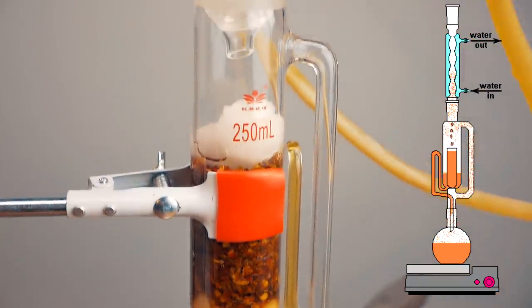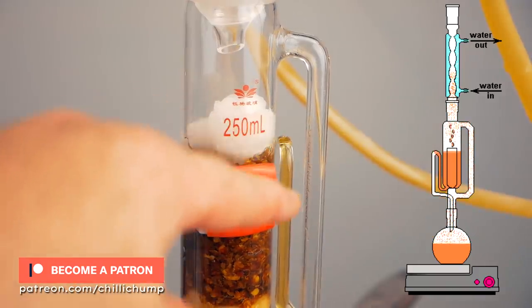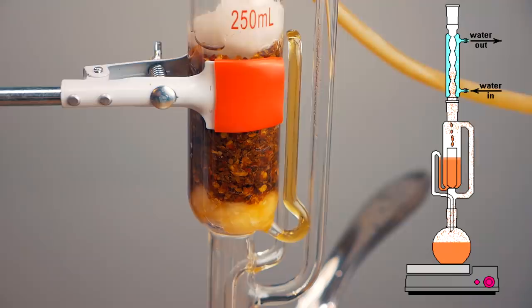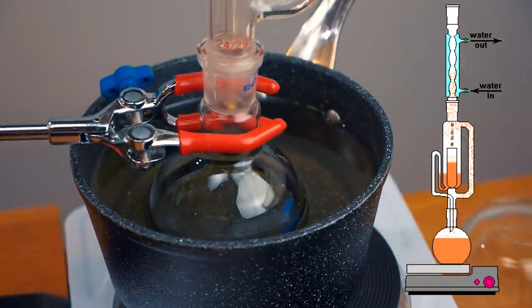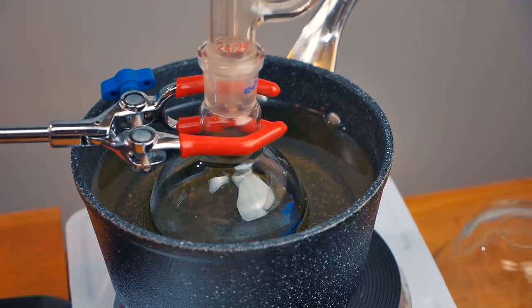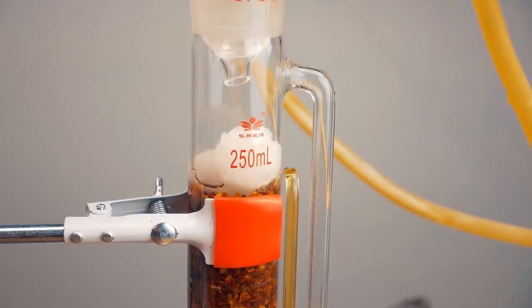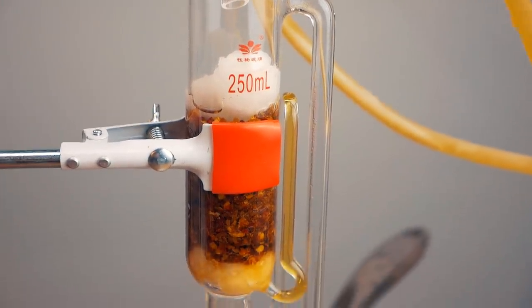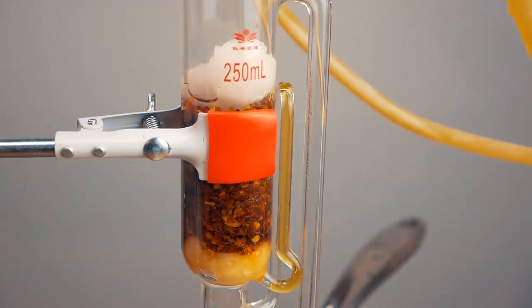Because what's going to happen is once this here is topped up beyond this level and we create a bit of a siphon in that loop, what's going to happen is all that colored liquid, which is pulling the capsaicin from the chili peppers, is going to drip down through back into this ethanol that's down the bottom there. And when we're distilling the ethanol, we're going to have pure ethanol coming back up the tube, back to the top, and starting that cycle again, which is then going to keep pulling more and more of the capsaicin from this until eventually you're going to see that instead of this being this orange color, it's going to be clear, and then you know the process is done.